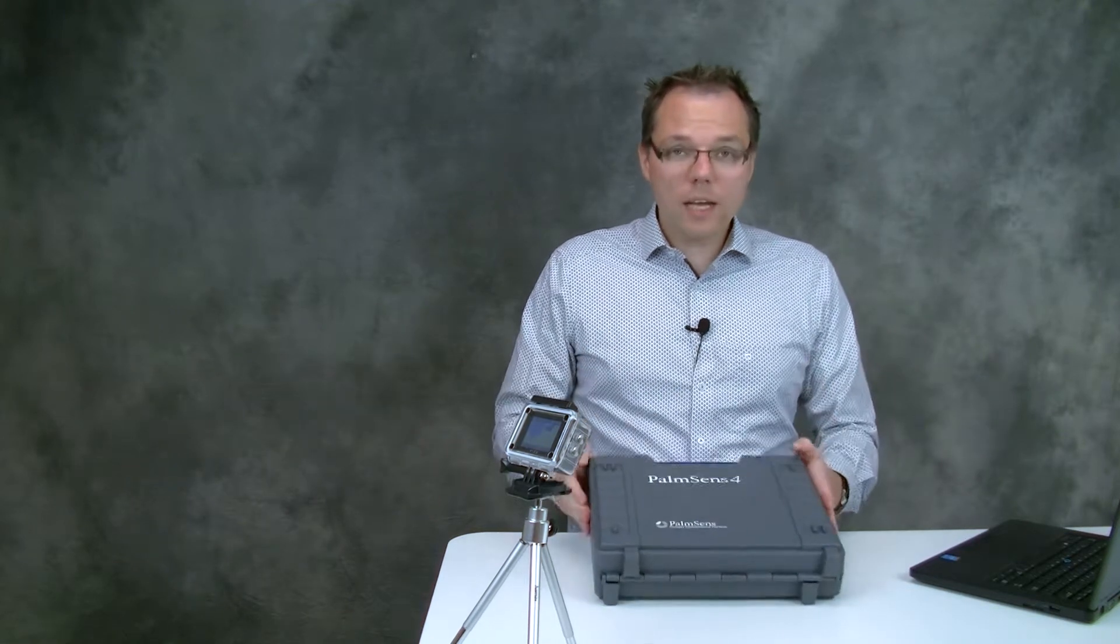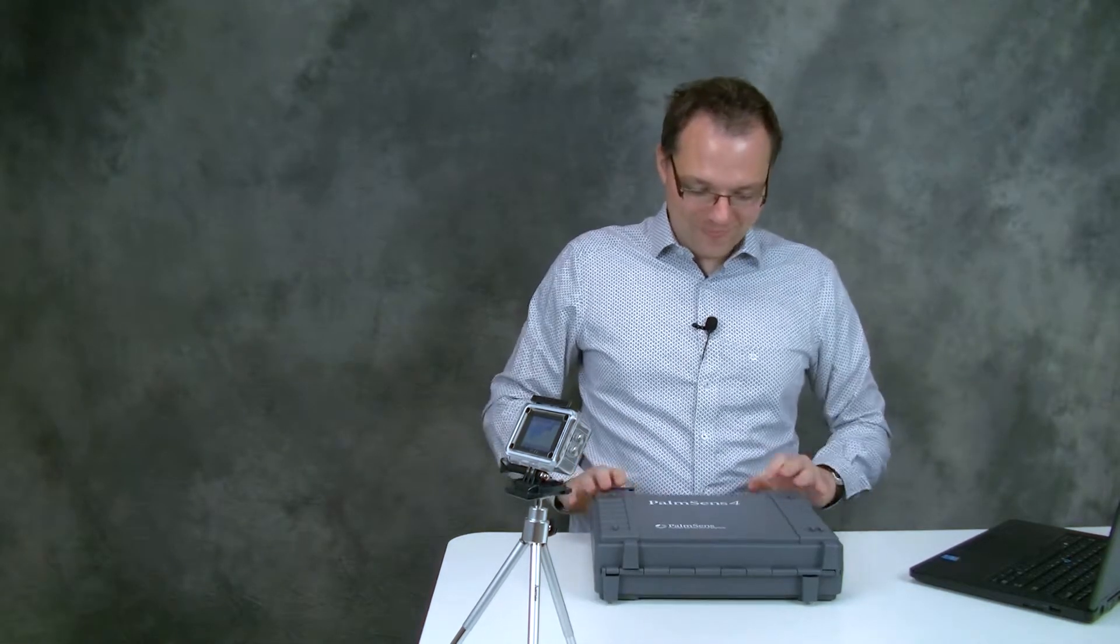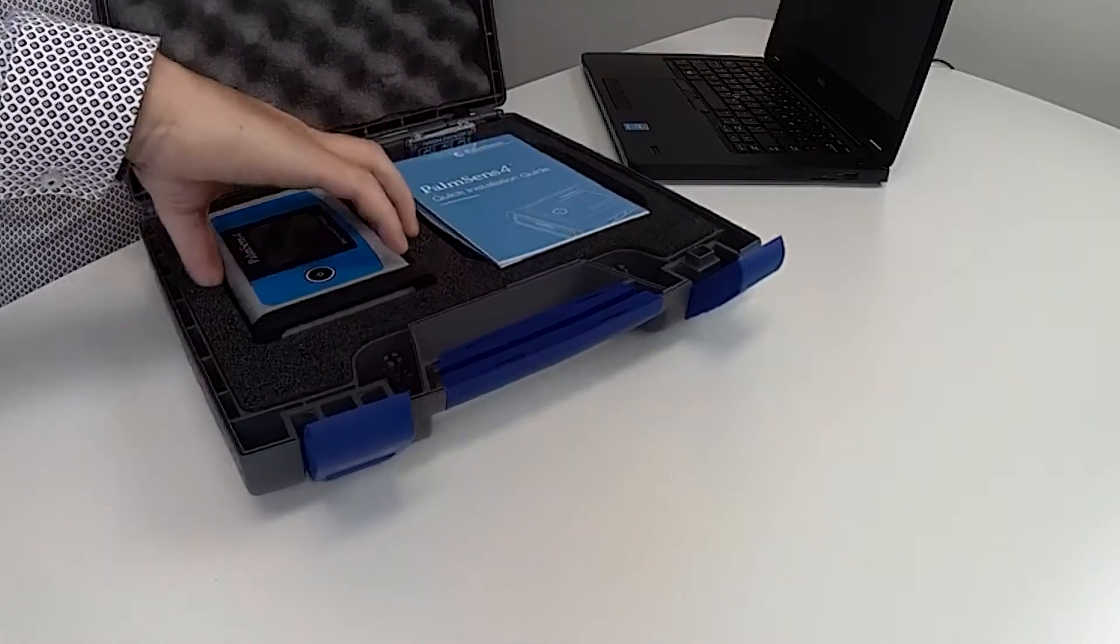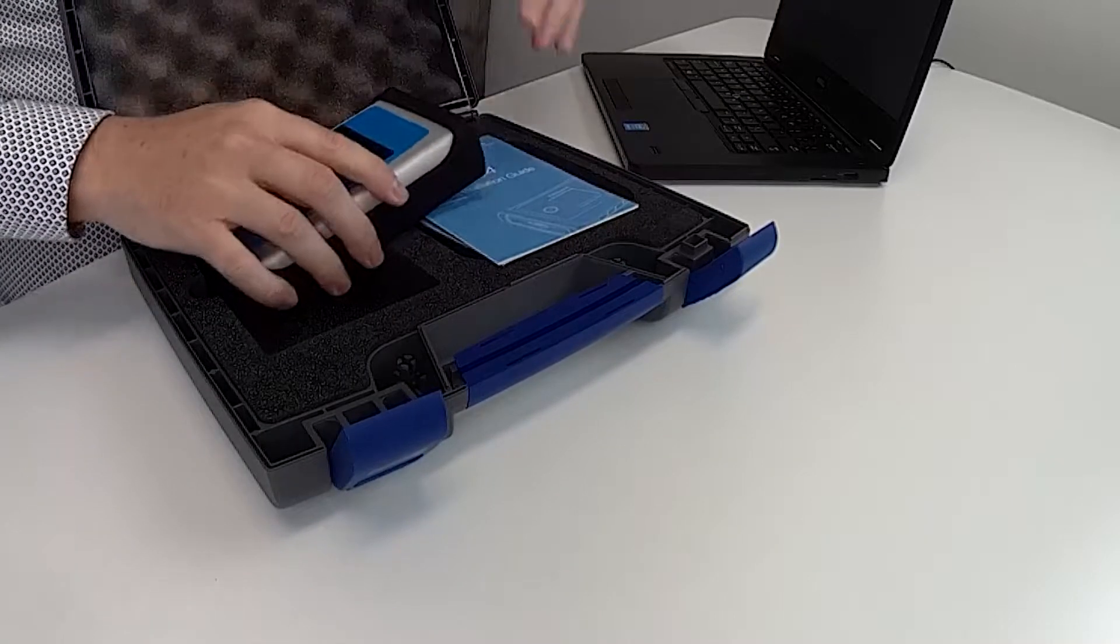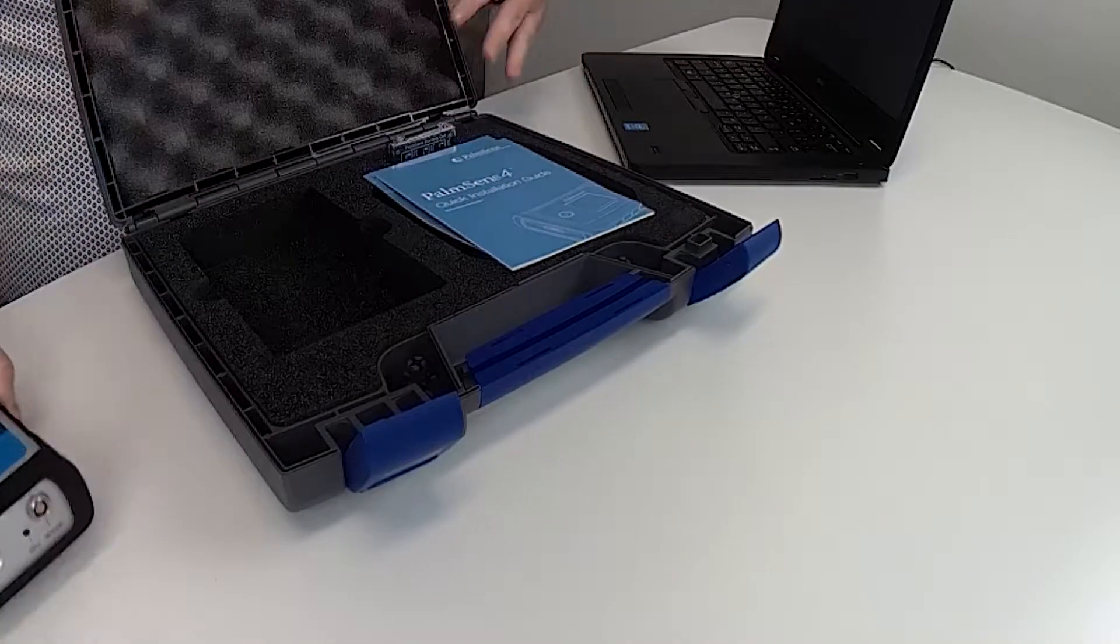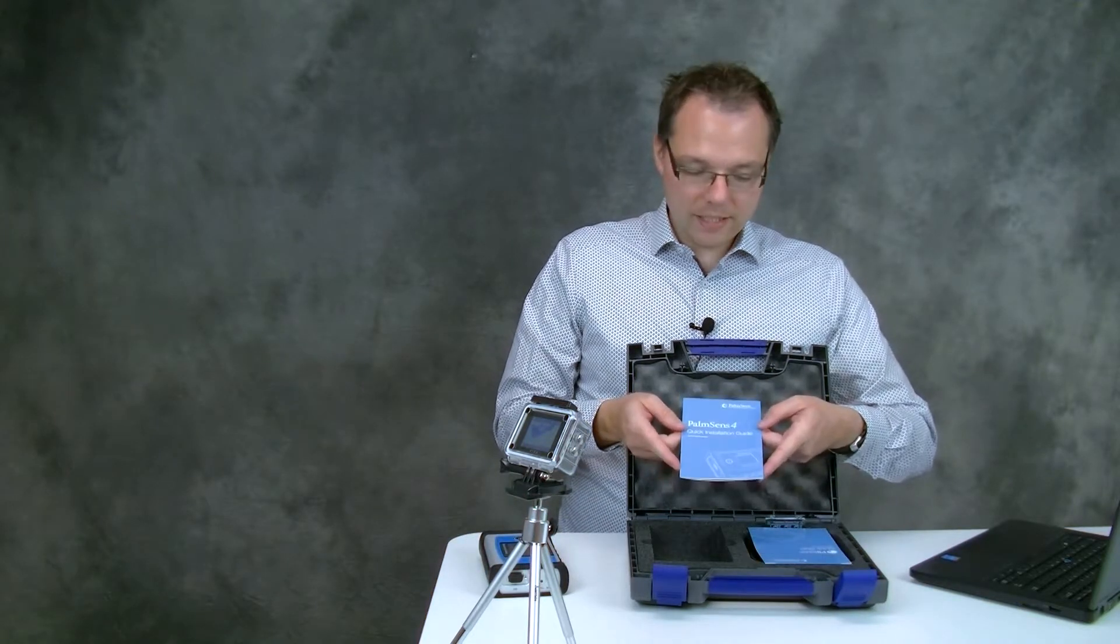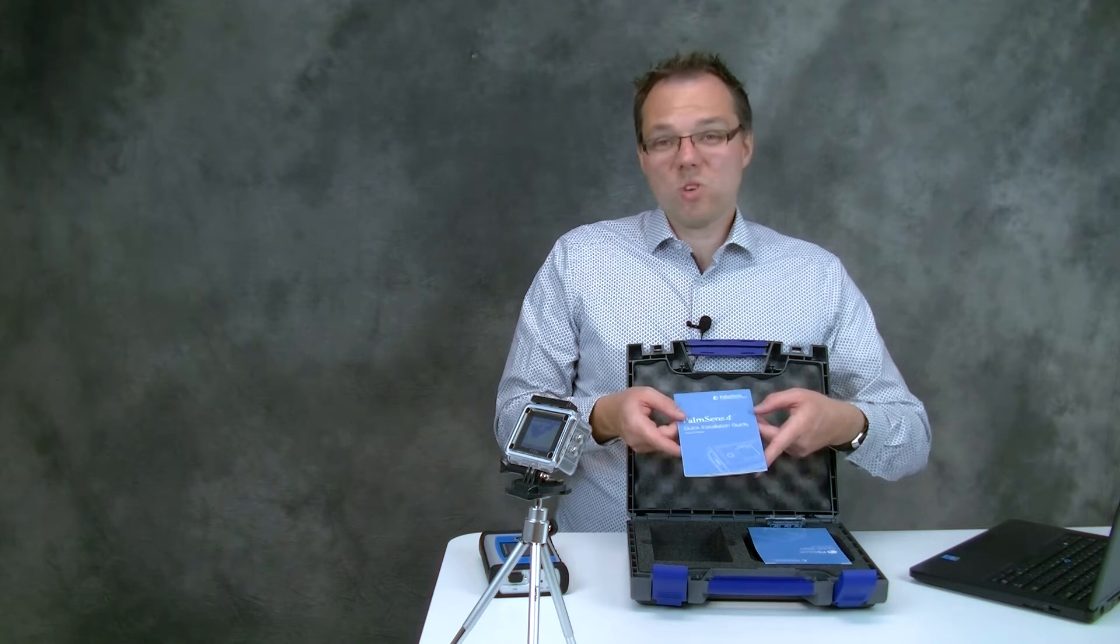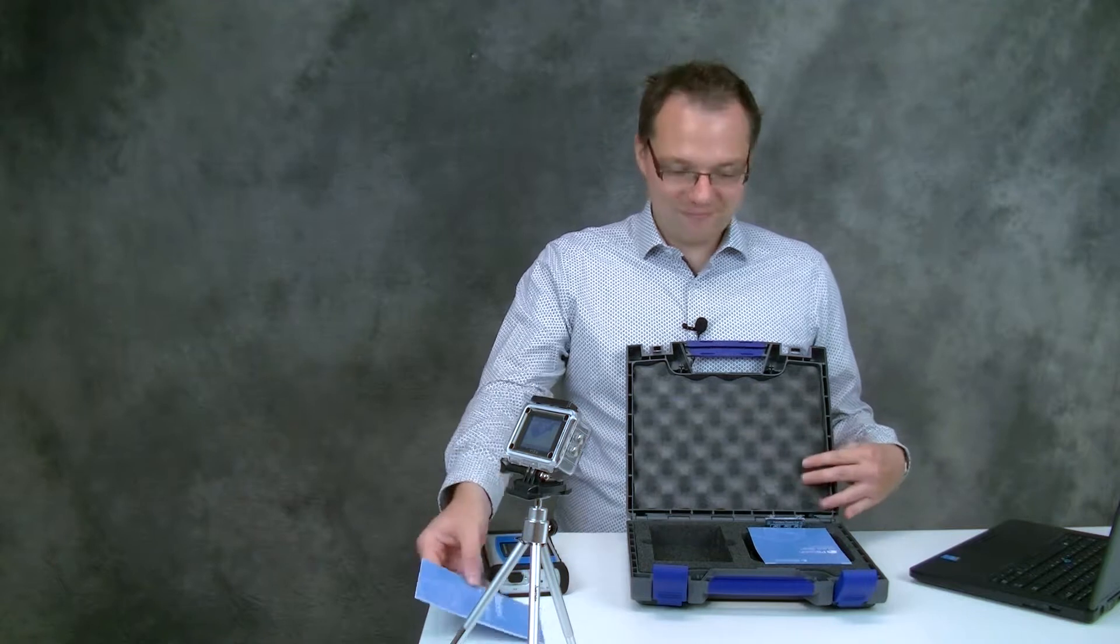So inside the box you will find, well of course you will find your PalmSense 4 in it. You will find a short quick installation guide. This is for example if you're not a fan of watching videos you could stop right now and use this installation guide.